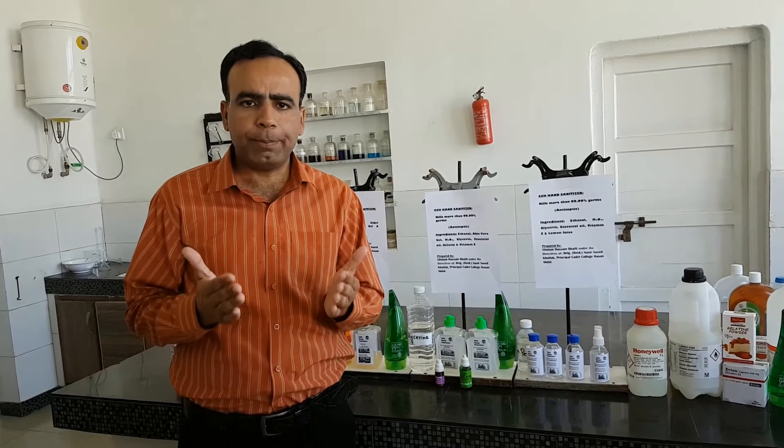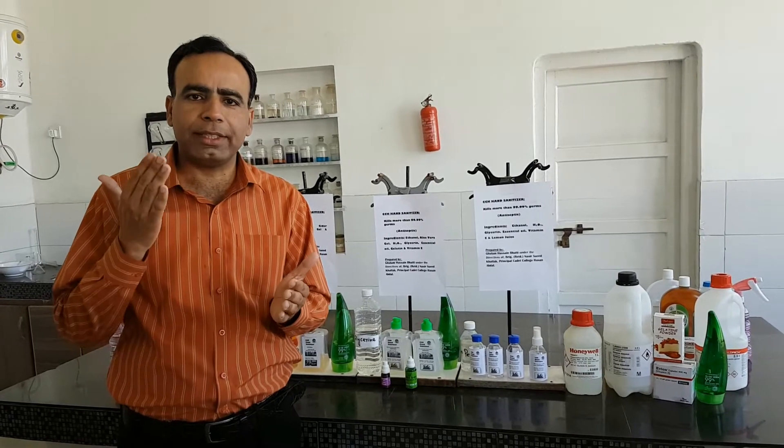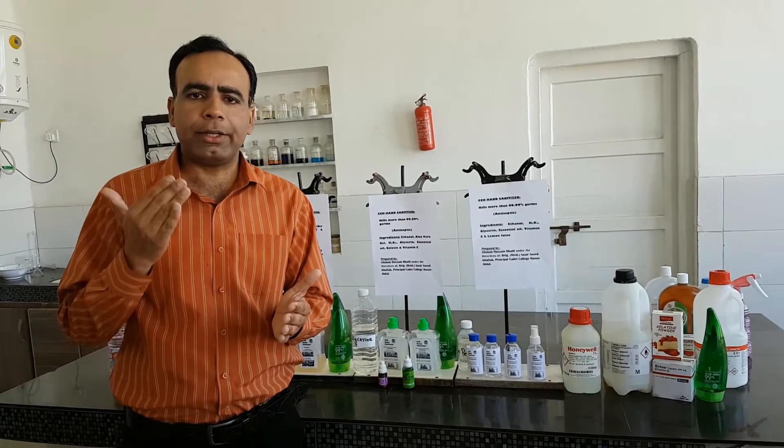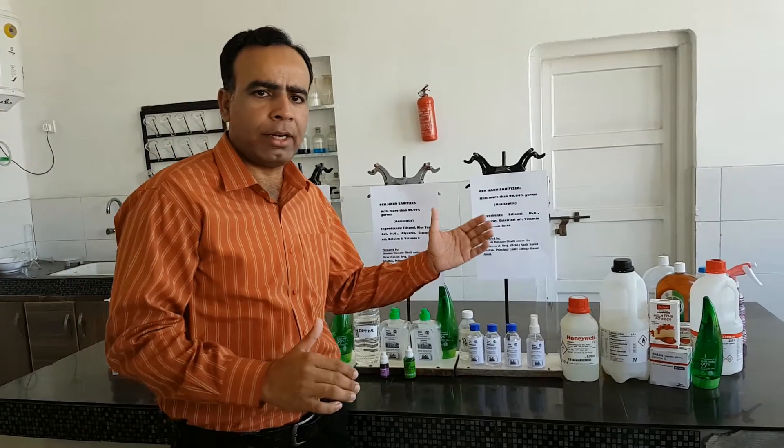Dear friends, I have prepared three types of hand sanitizers in the chemistry lab of Cadet College Hassan Abdal. These hand sanitizers are as follows.